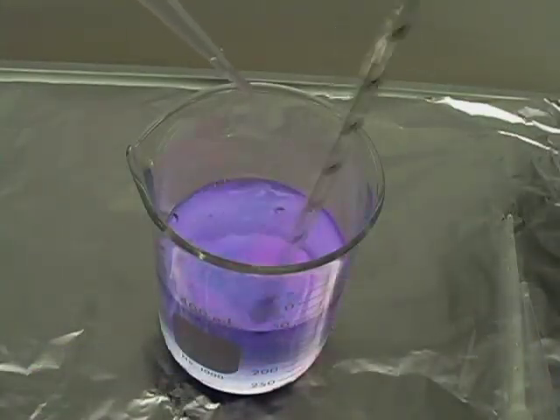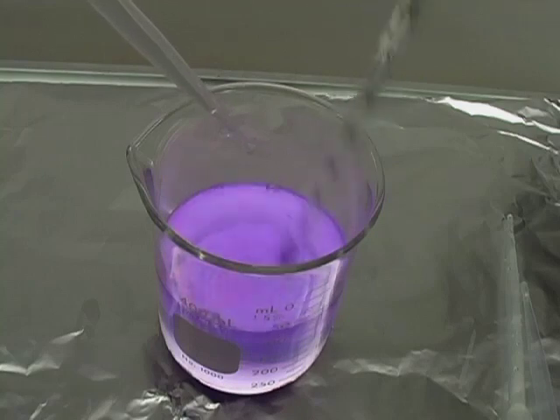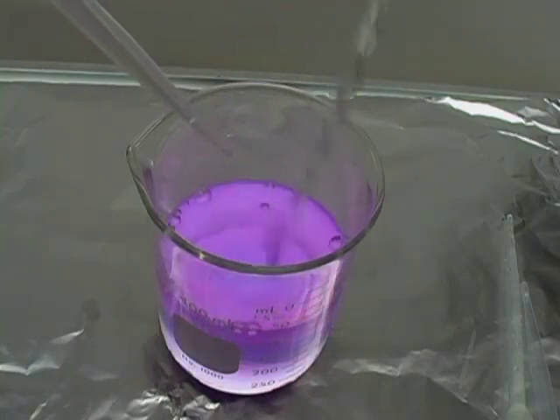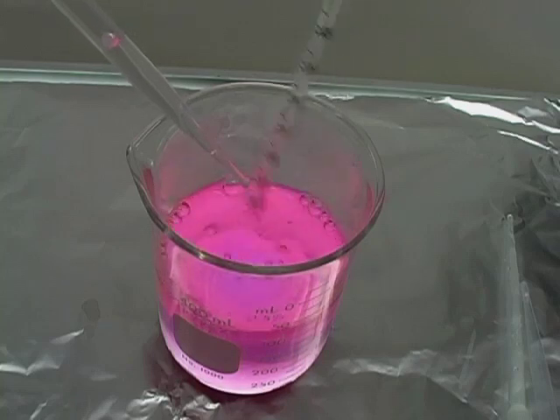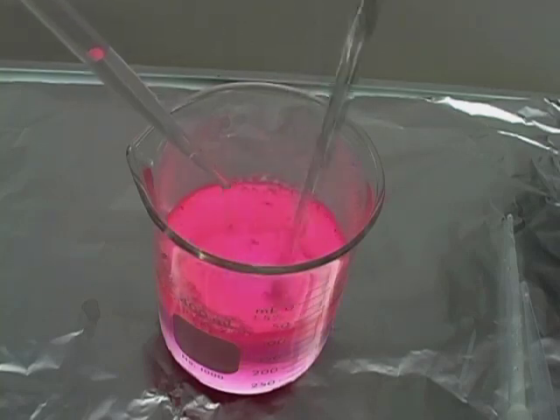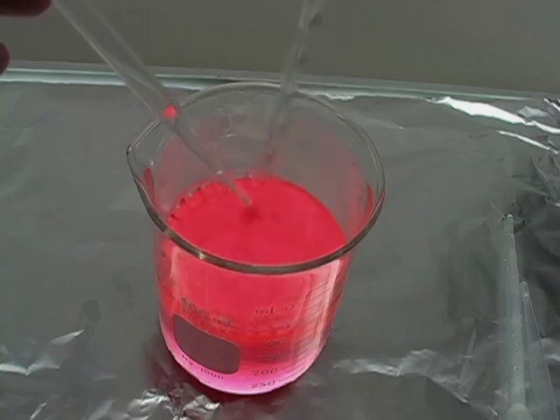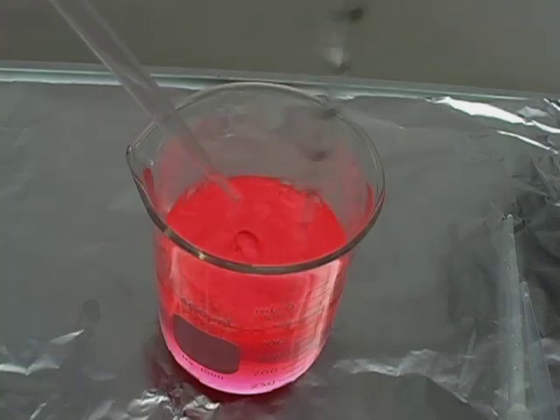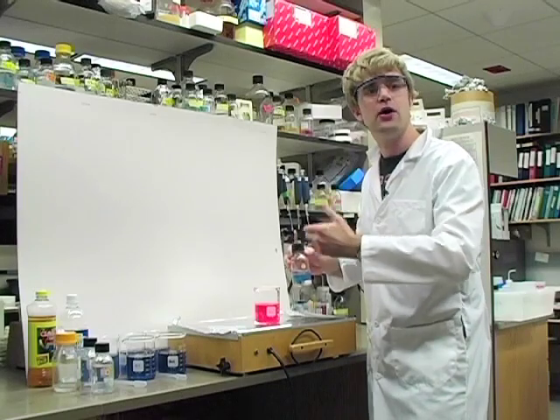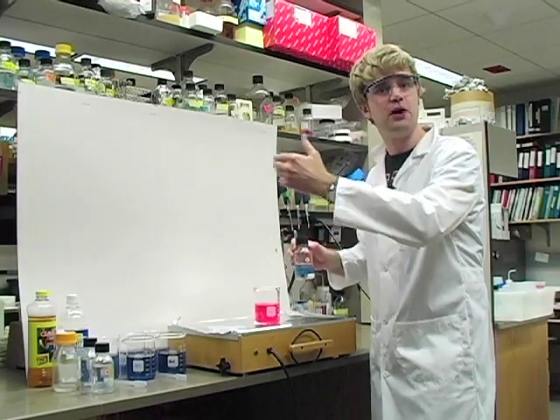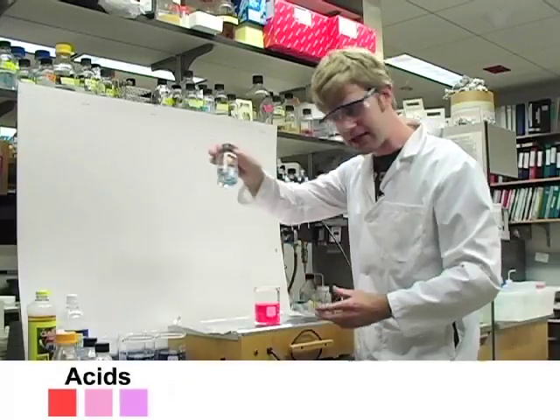I'm going to take a chemical and add little drops of it to the indicator. See, these drops make a very light purple, and there's some pink, and it gets pinker and pinker the more I add. And now it gets darker and darker, and I eventually get a really deep bright red. If we add a chemical to this indicator and it makes it redder and redder — starts with purple, then goes to pink and goes to red — we call it an acid. So this chemical here is an acid.